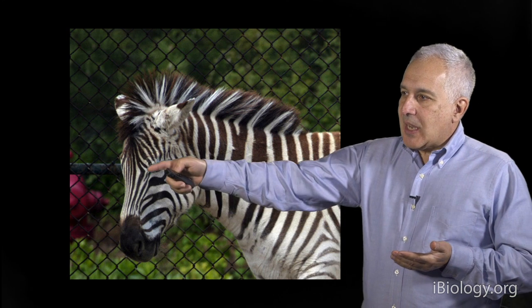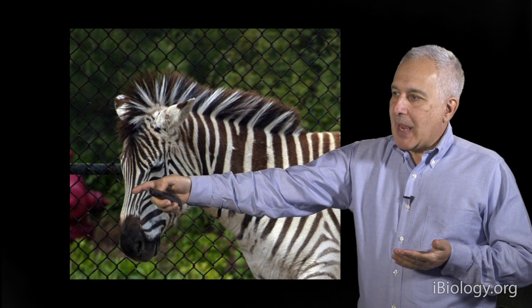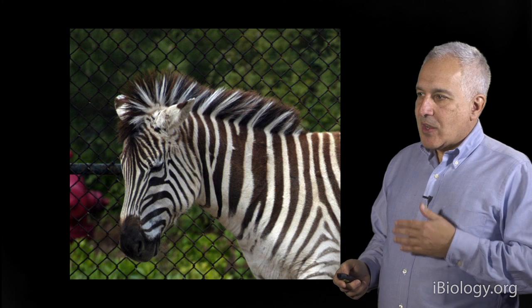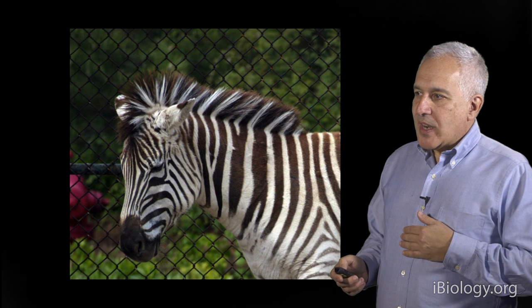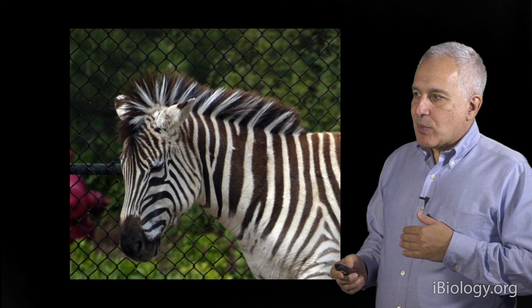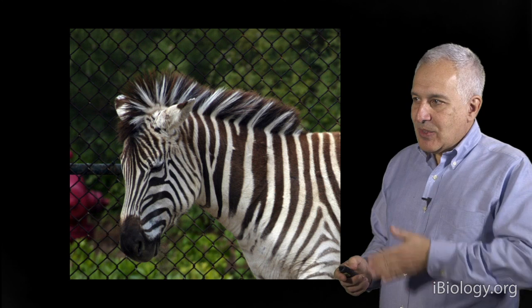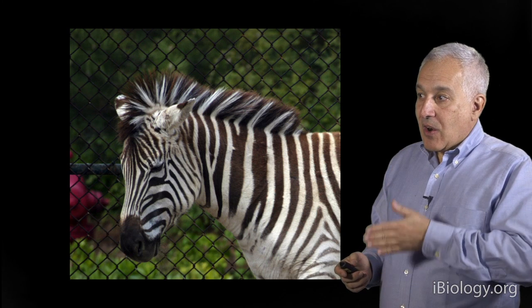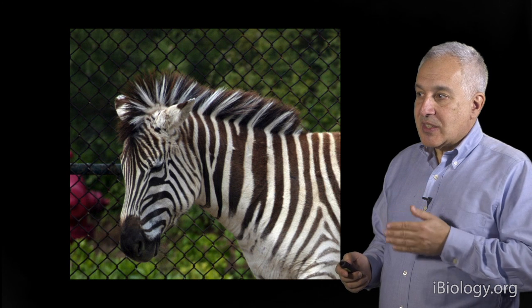There is still, I'm not sure you're going to be able to see on your monitors, there are still some bands that are running horizontal across the front of the nose at the finest resolution. If we go one higher, and for most of you, you probably won't even detect the difference, now finally even the vertical stripes there are obvious, whereas in this previous image, they're slightly diagonal.